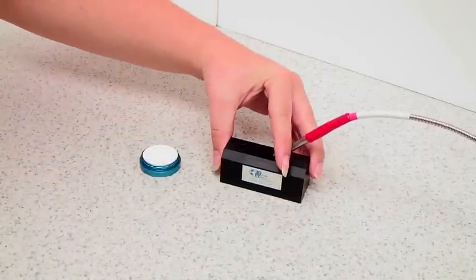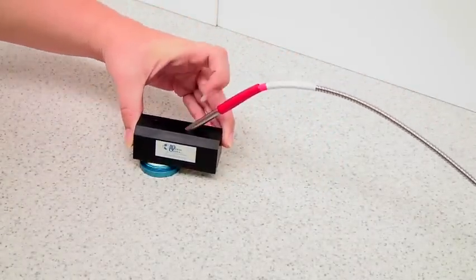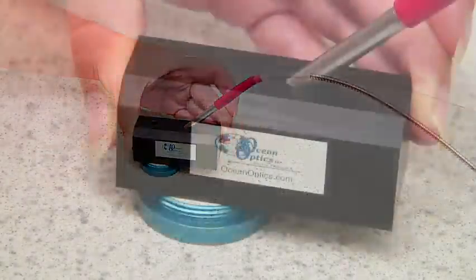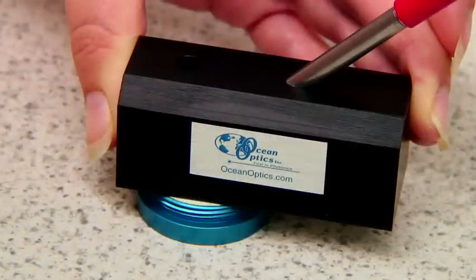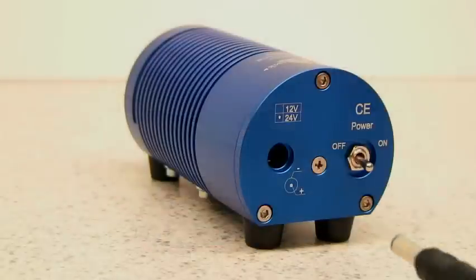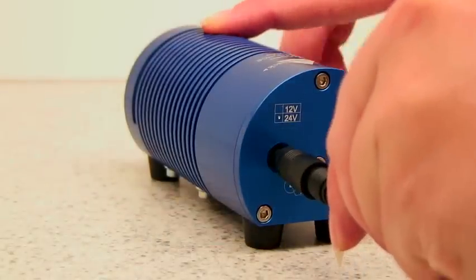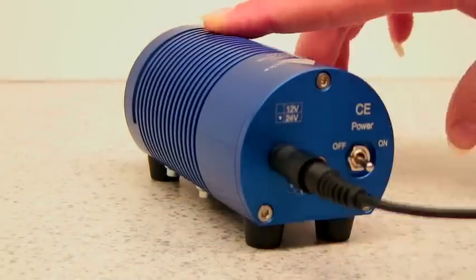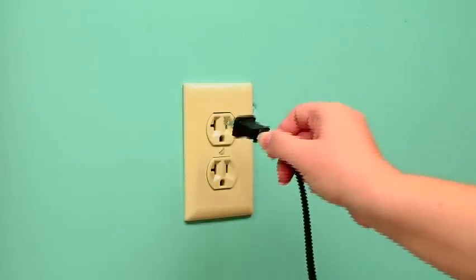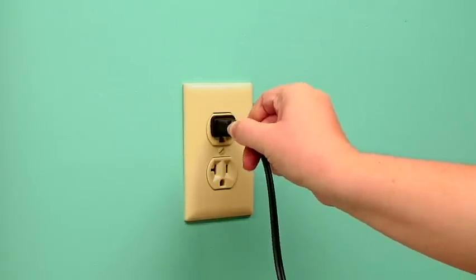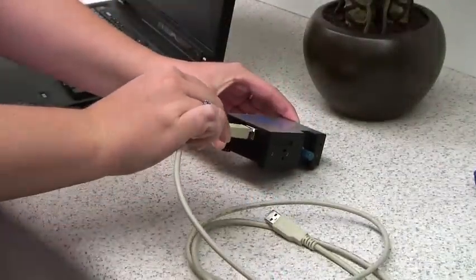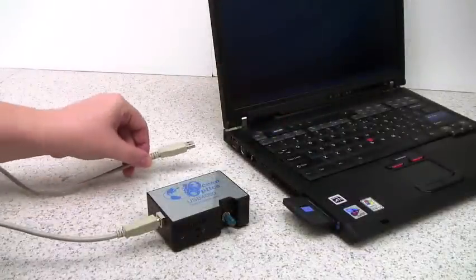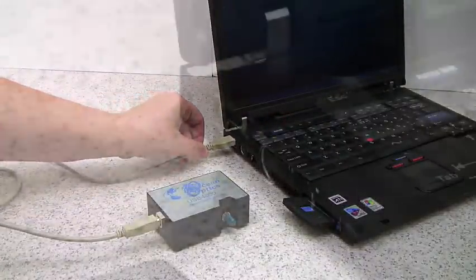At this stage, you should place the RPH1 probe holder onto the white standard. The standard is an ideal reference because it's nearly 100% reflective. Next, connect the power supply to your light source and turn it on. Make sure to let the light source warm up if necessary before performing your experiment. Now connect the appropriate ends of your USB cable to the spectrometer and to your PC.